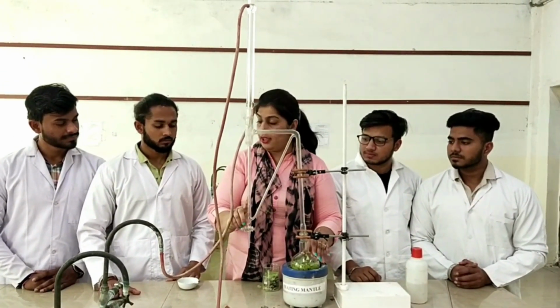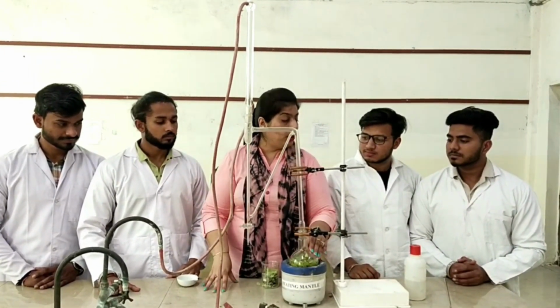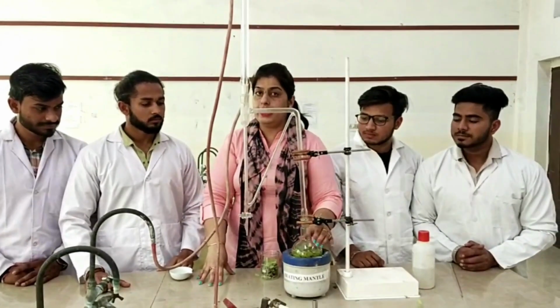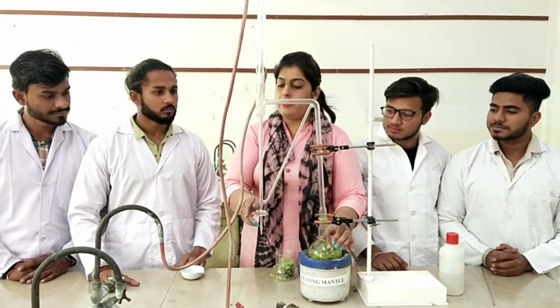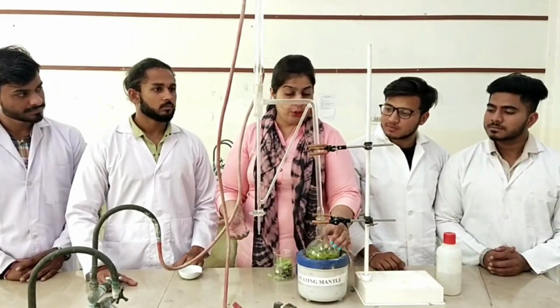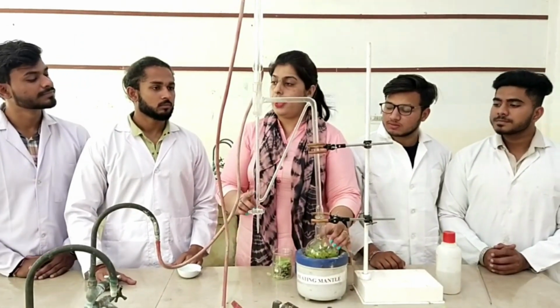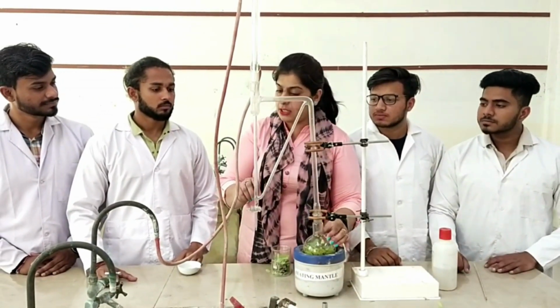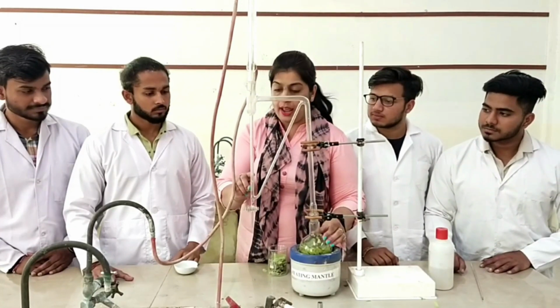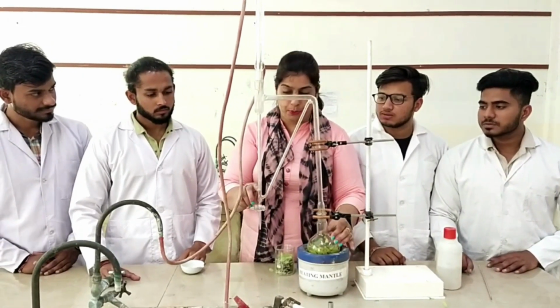in this portion. You know that volatile oil is the oil which is volatile in nature. It has aroma, and the oil gets evaporated when it is kept at room temperature. The volatile oil of eucalyptus has less density, so it will be placed in the upper portion and the water will be at the lower portion.